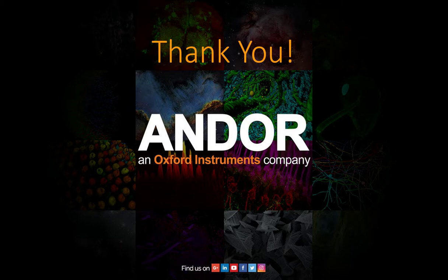And the main differences between the mosaic and micropoint are that micropoint allows single point illumination, and you can use it for higher laser power applications, such as ablation and DNA damage. Whereas mosaic is a device more suitable for optogenetics, is extremely fast, and allows simultaneous multi-point illuminations of complex regions. Thank you so much for your question.